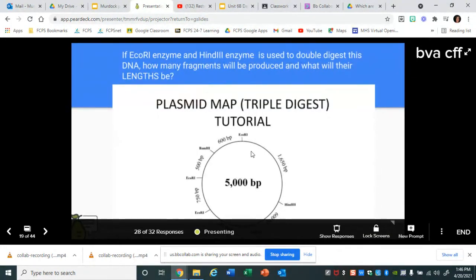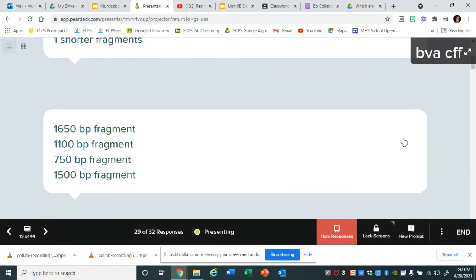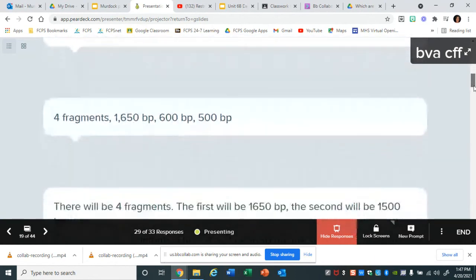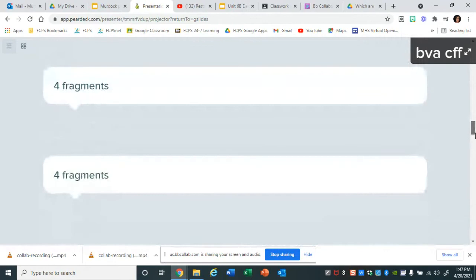Oh, no, you're right. I'm sorry. My eyes aren't very good. No, you're right, Carter. Forgive me. So let's see. 1, 2, 3, and 4. Yeah, so there should be 4 fragments. Do you see that? Everyone good? Yeah, okay. And the presentation station is in the way. So 4 fragments total is the correct answer. That's good. 4, very good, yes. 4 fragments. It looks like most of you got it.